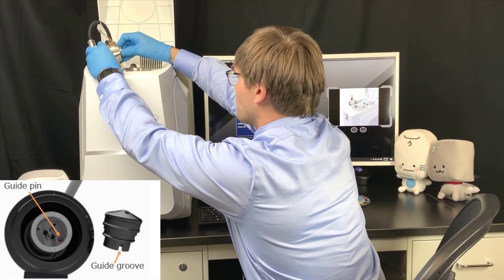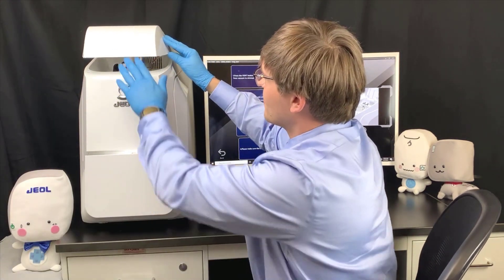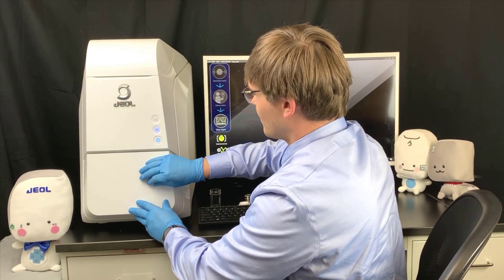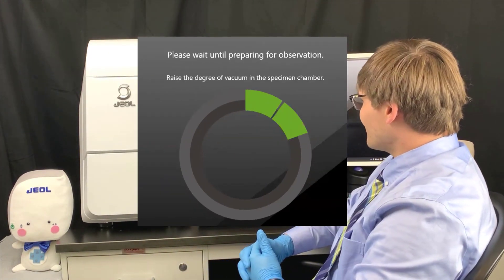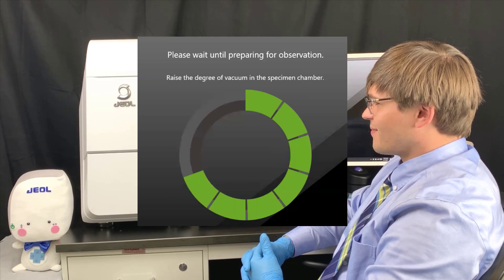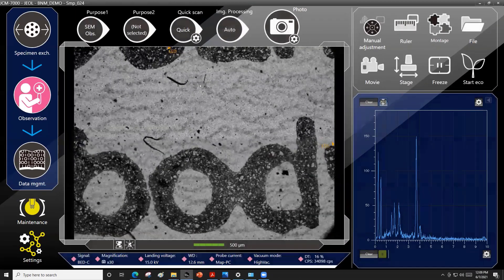Then close the gun chamber door and close the top cover. Close the specimen chamber door to automatically begin the evacuation process. Once evacuated, the observation conditions are applied, and an auto gun alignment, auto focus, auto stig, and auto contrast and brightness will be performed.